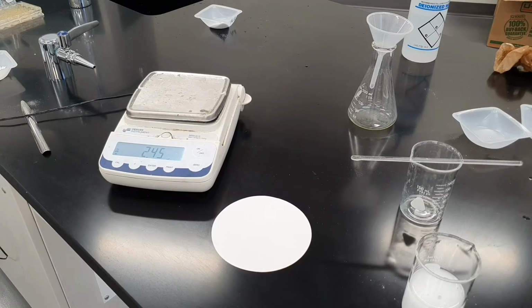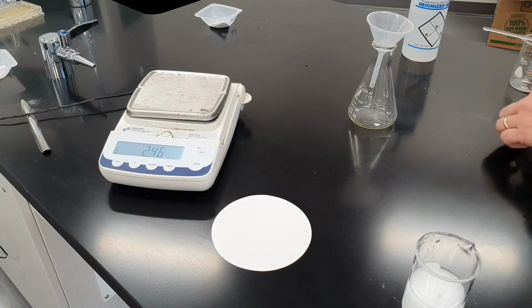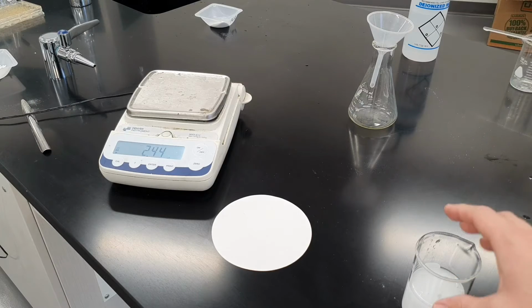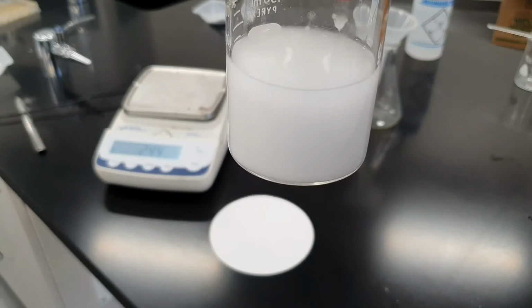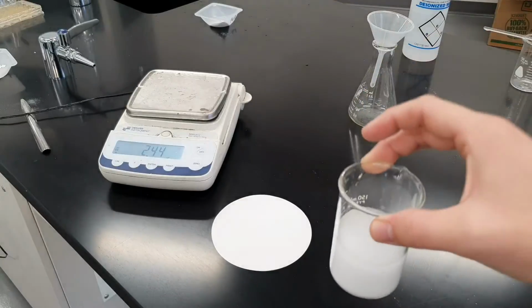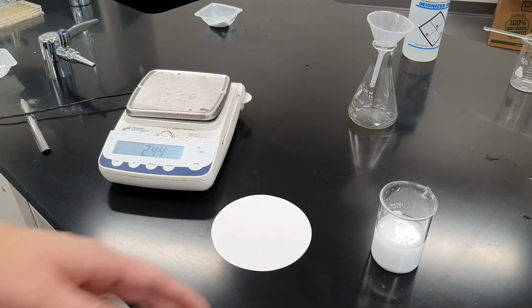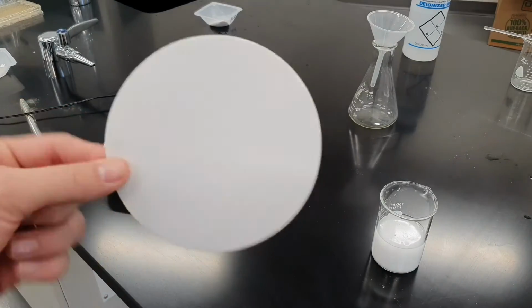So here we are, ready to filter our solution now. And some tricks that we know. First off, we know there's something that's solid in this beaker because it's so cloudy. Okay, this is not soluble, and as we're sitting here letting this go, what you're going to start to see is it's going to start to kind of settle down to the bottom a little bit. If we were to let that sit overnight, that would be the case. But there's a solid in there, something that's not soluble in water, so we're going to want to filter that out. And one of the best ways to do that is just with plain old filter paper.